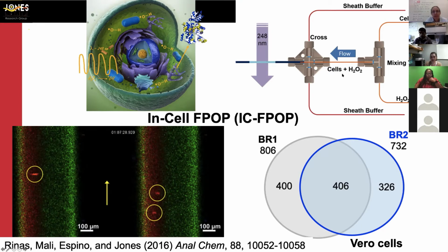Okay, thank you. So that's really interesting that FPOP will work for the in vivo, and I wonder if the X-ray footprinting will not work so well for the in vivo type of studies. I think that's possible. It will be more difficult to do it with the X-ray because of the lack of oxygen. Okay. Yes. Great.